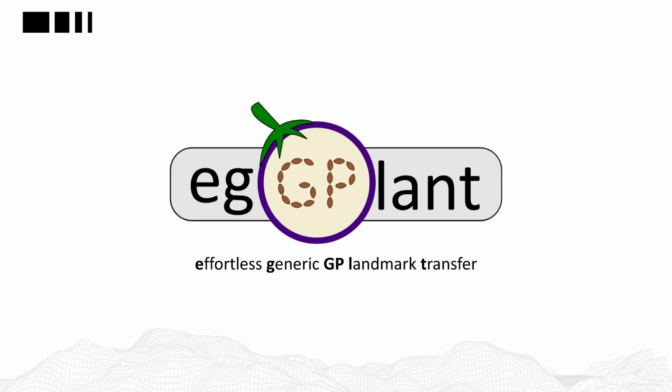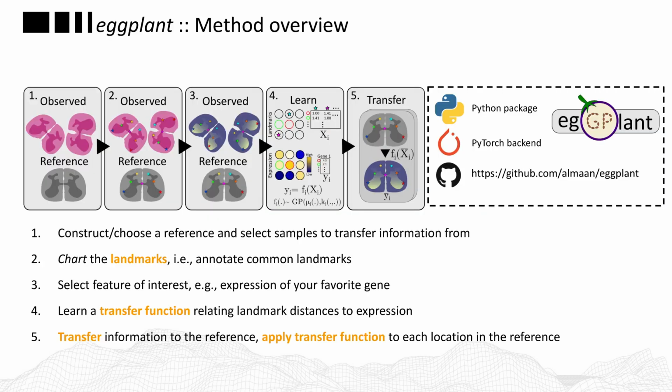So with that being said, let us now have a look at how this method works. And you can more or less summarize eggplant in 5 steps, where we start off by constructing or choosing a reference that we want to transfer information to, and then we select the samples that we want to transfer information from to this specific reference. Next, we chart the landmarks, meaning that we annotate common landmarks found in both the observed data and in the reference.